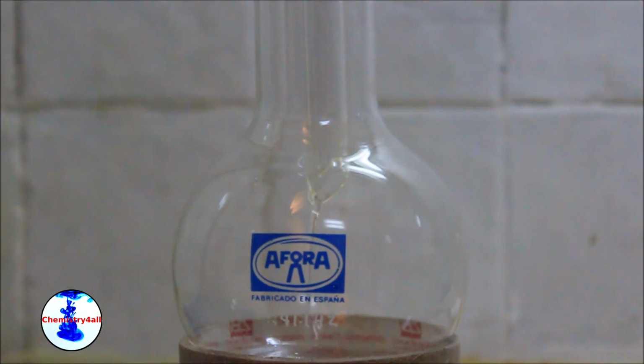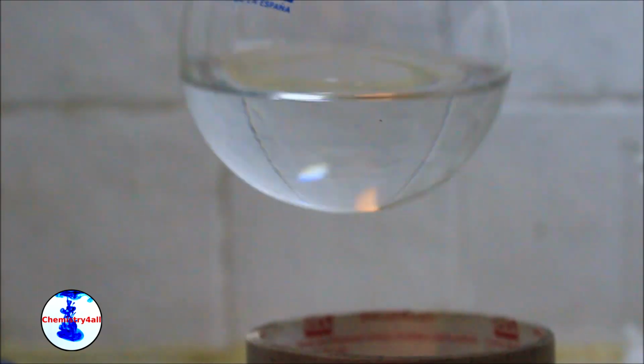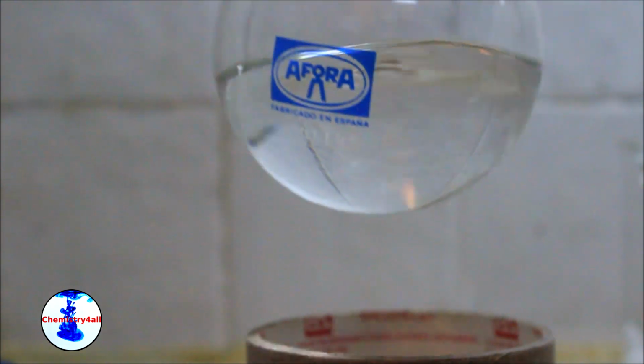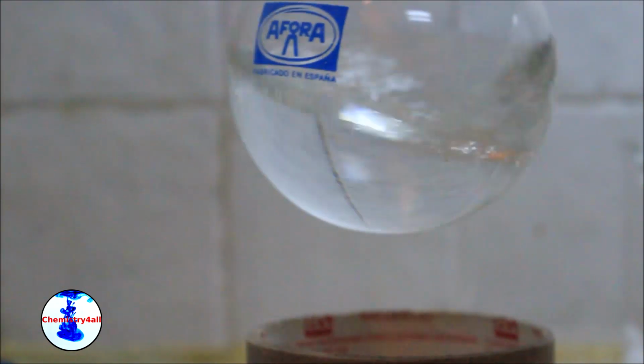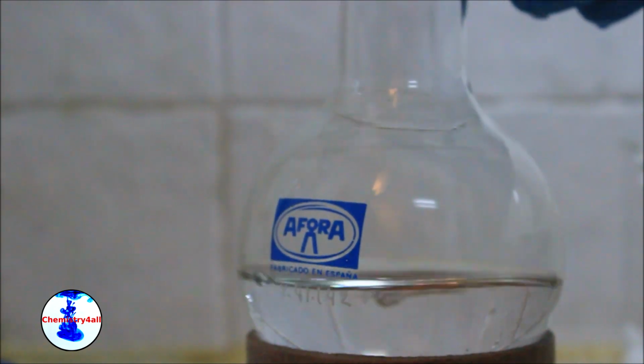Alright, so at this point I have obtained a total mass of 97 grams of ethyl acetate, which is way above the expected yield. This indicates to me that the ethyl acetate is far from being pure, and it's likely to contain large amounts of ethanol as contaminant. Indeed, I've decided to take several Raman spectra to see what was going on.